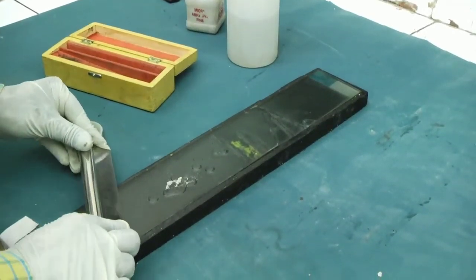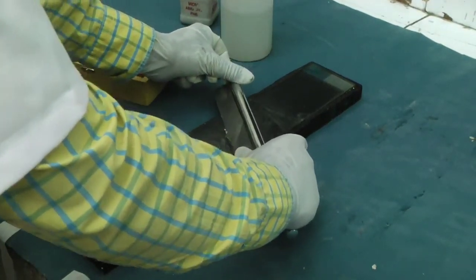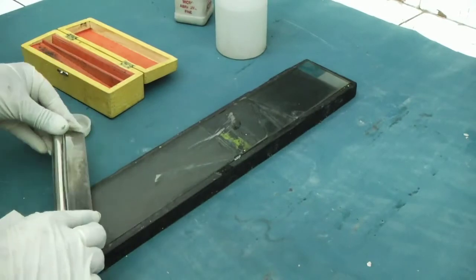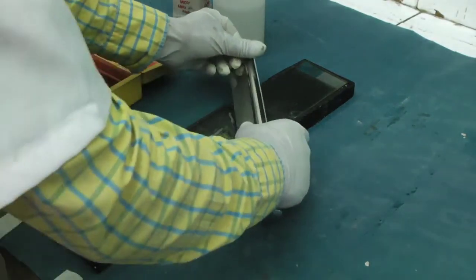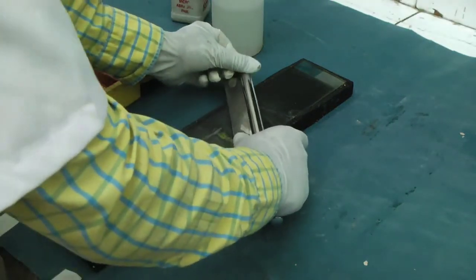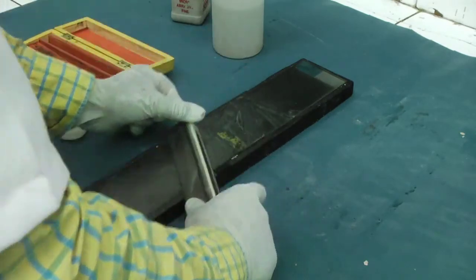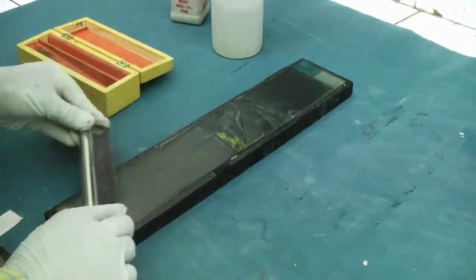The knife is pushed forward diagonally from heel to toe to the other end of the hone, turned over on its back and moved across the hone until the heel is in the center with the cutting edge leading, and then brought back diagonally. It is then turned across the hone to its original position.